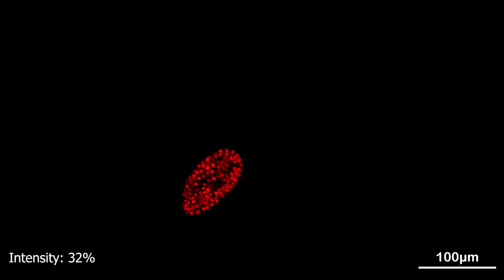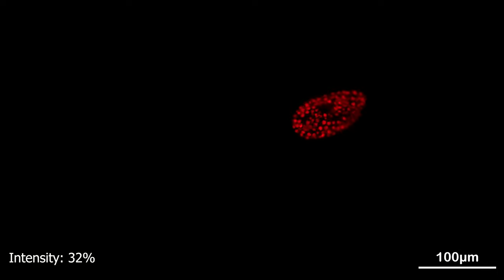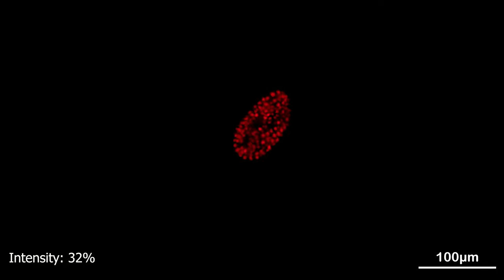We observe that within a few seconds, there is a big intensity drop which ultimately reaches a plateau of 15% of the initial fluorescence intensity observed.